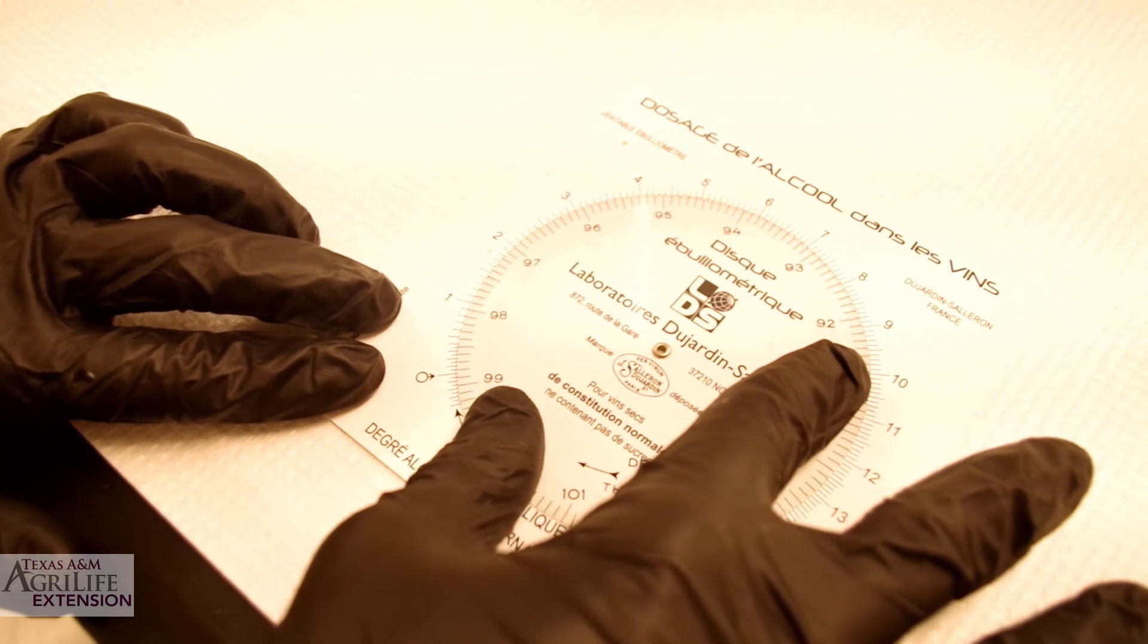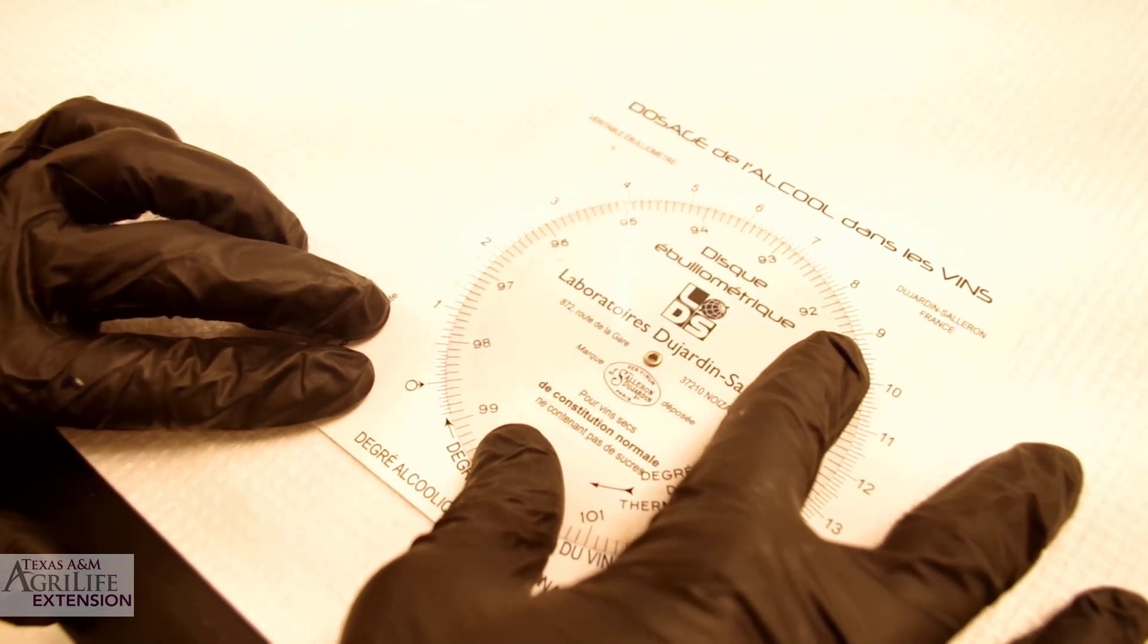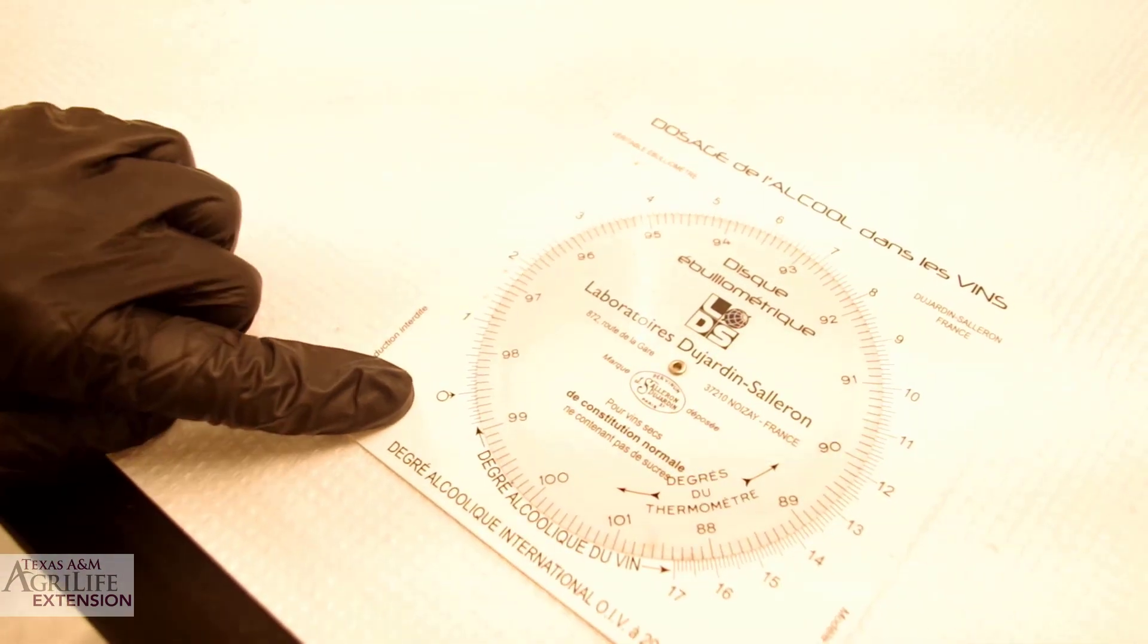On the dial, we line up our temperature, 98.5, to the symbol with a circle and arrow.